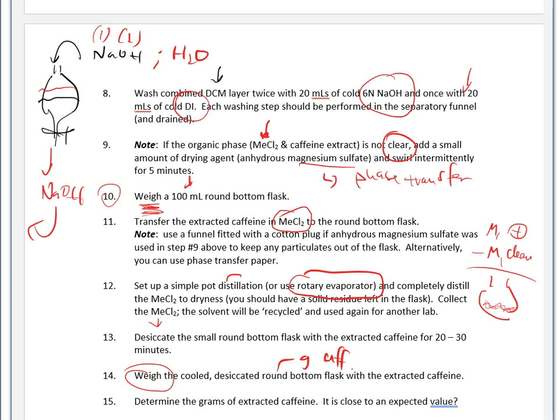Now, I know that this is a crude product, right? We didn't do any type of purification here. We did one extraction, and that extraction got hit into a separatory funnel with some different solvents, but we did not fully go through like a recrystallization process. The directions are actually not going to tell you to do that at all.